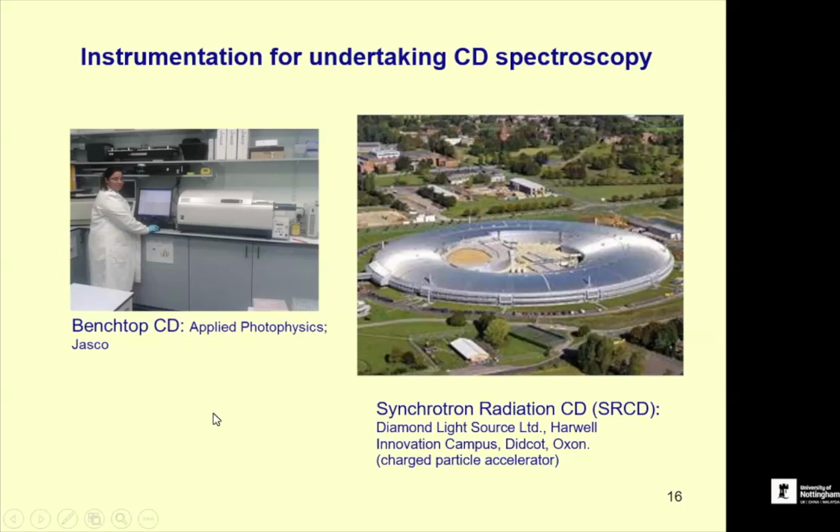For other applications, there is a benchtop instrument which you can see here, which works for most of the far UV and certainly for the near UV regions. It's very good, and those instruments are becoming very sophisticated now. Membrane proteins, which I work on, are very difficult to produce in any amounts, and therefore I've always gone to Harwell to do my studies of membrane proteins, simply because I can't produce enough of them to use a benchtop instrument. But benchtop instruments are becoming better now, and I'm starting to consider going over to benchtop.